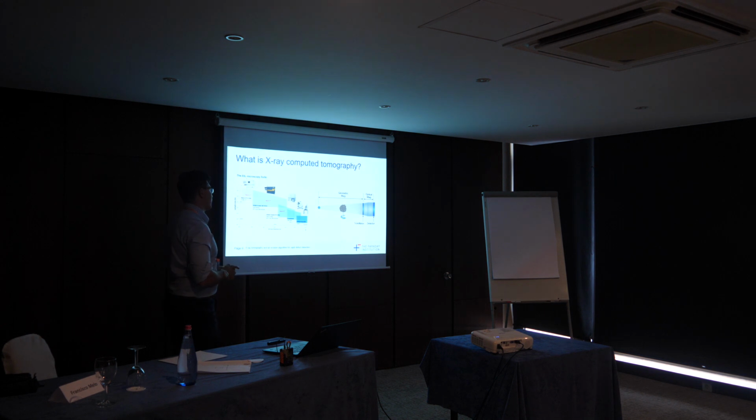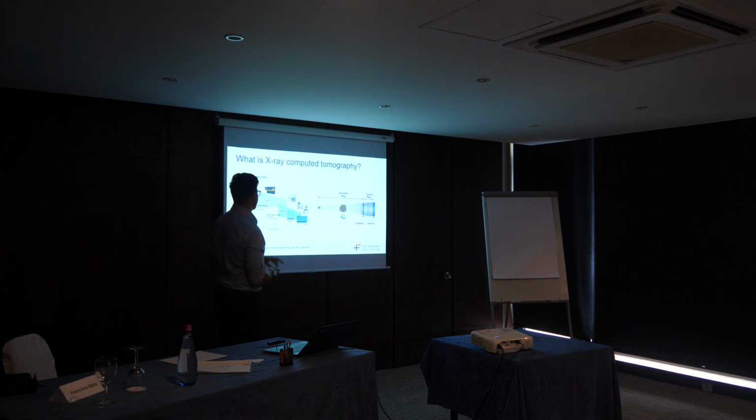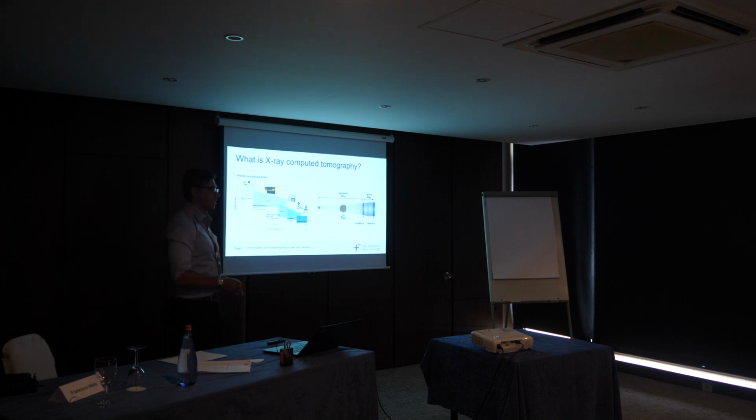So, a quick little background: my lab has three CT machines, so we can do anything from nanometers up to microns to a whole phone, a nice big range of imaging scales. CT works by shining an X-ray at a sample, and that's called a projection. You expose that for a certain length of time, then you rotate it and do that again, get hundreds to thousands of projections, then reconstruct it into a nice 3D volume.